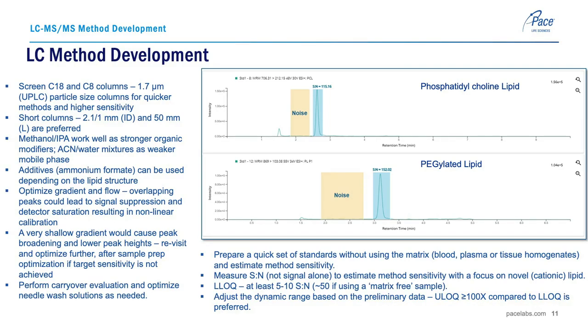Also evaluate carryover. If the carryover for analyte is significant, comparing the response of the solvent blank injected right after the upper limit of quantitation, optimize the needle wash to bring the carryover less than 10% of the LLOQ. Also, a quick set of calibration standards can be prepared without any matrix components to assess the linearity and method sensitivity. The concentration of the internal standard can be about 5 to 10 times of the LLOQ concentration, and the concentration is kept constant across all the standards and QCs.